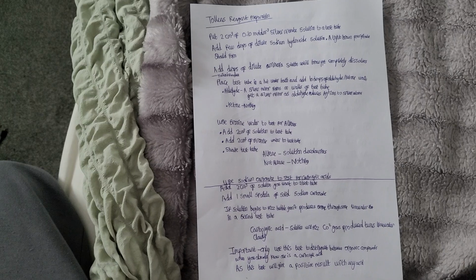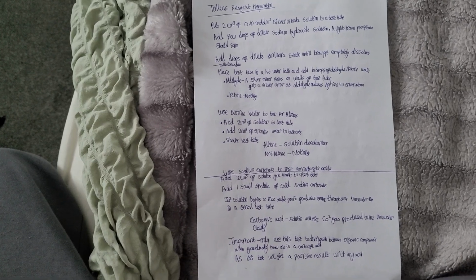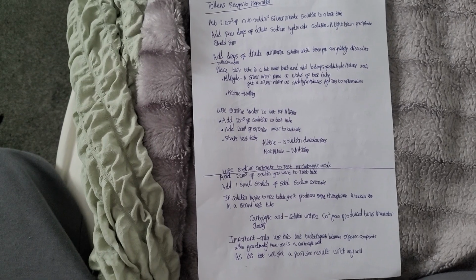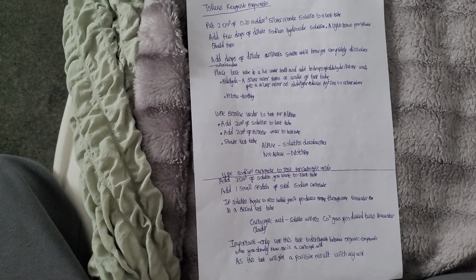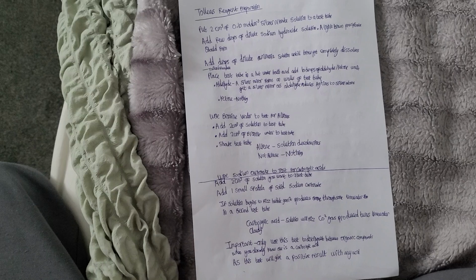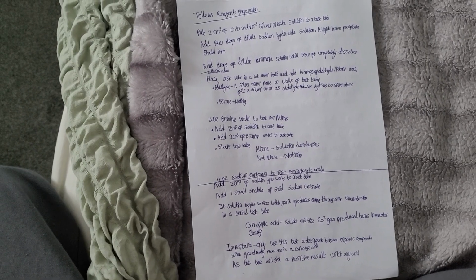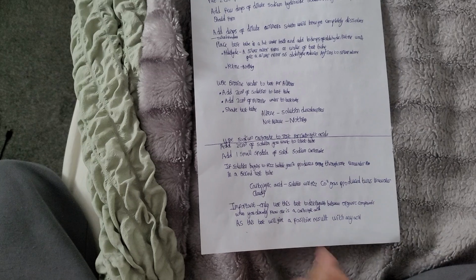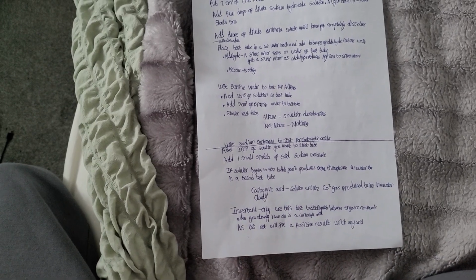Use bromine water to test for alkenes. Add 2 cm³ of the solution to a test tube. Add 2 cm³ of bromine water to the test tube. Shake the test tube. If it's an alkene, the solution decolorizes. If it's not an alkene, nothing happens.